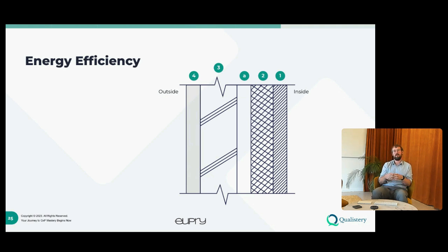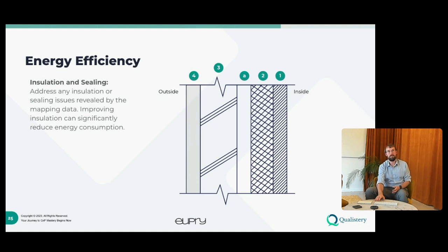because we do see examples of power failure tests that are simply unacceptable, because the temperature will rise or fall way too quickly outside those acceptable limits, simply because the insulation is not sufficient. And one thing is common insulation. I think that's often the thing that is referred to.